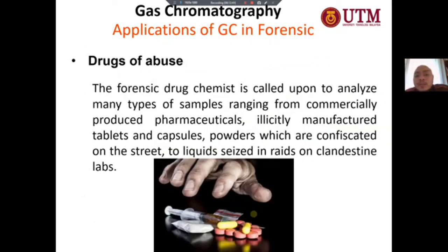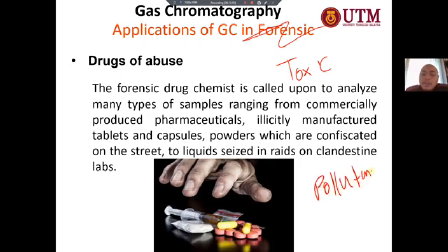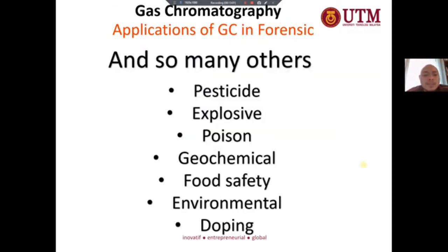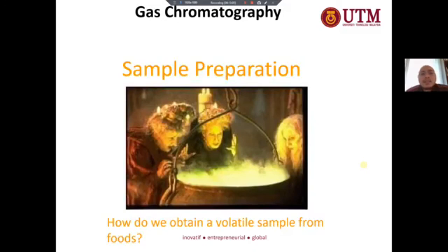Gas chromatography has a lot of applications, not only in forensics. For drugs of abuse, we can analyze toxic compounds, we can analyze pollutants. A lot of things we can analyze using GC. So here's just the example.